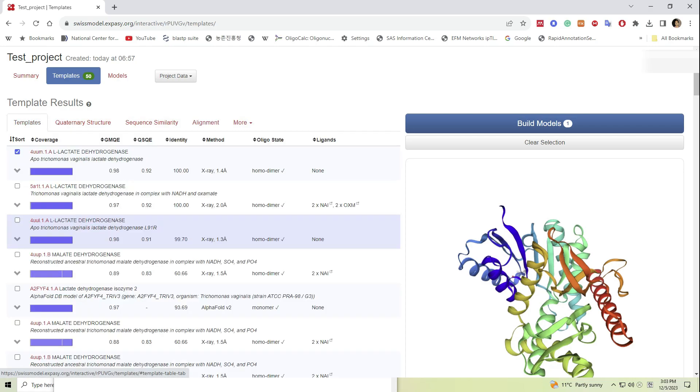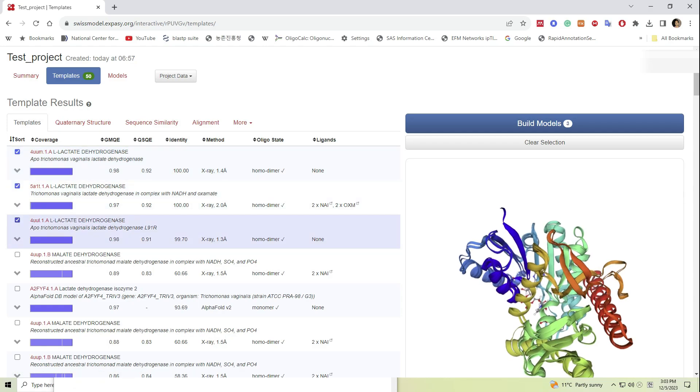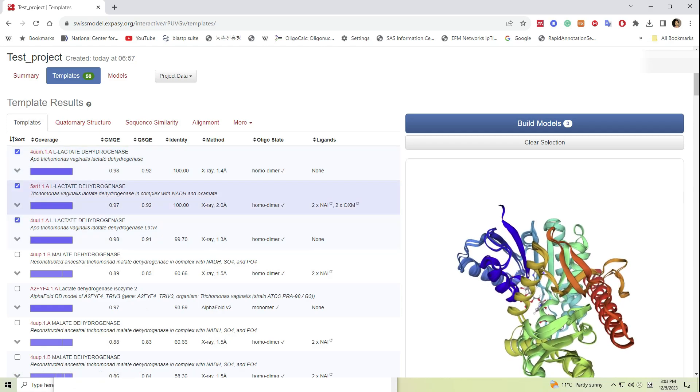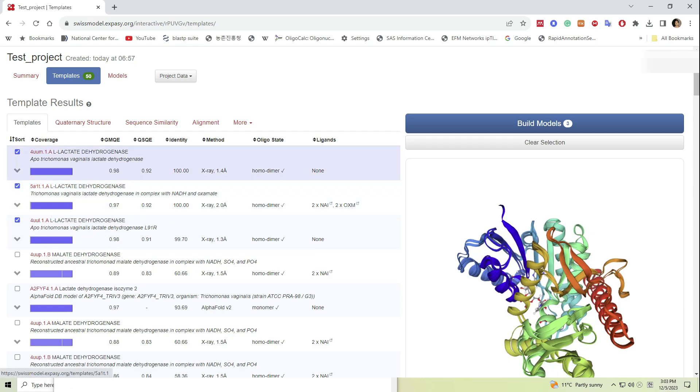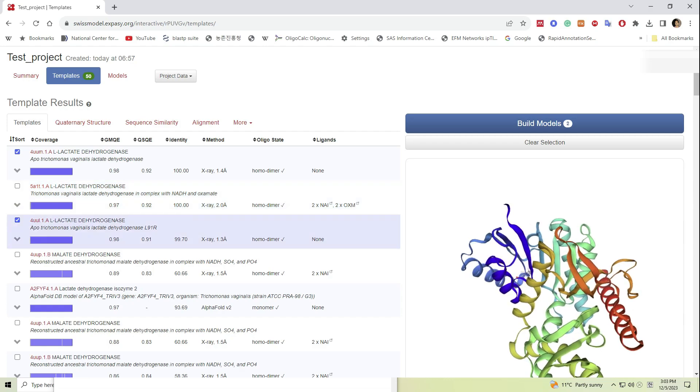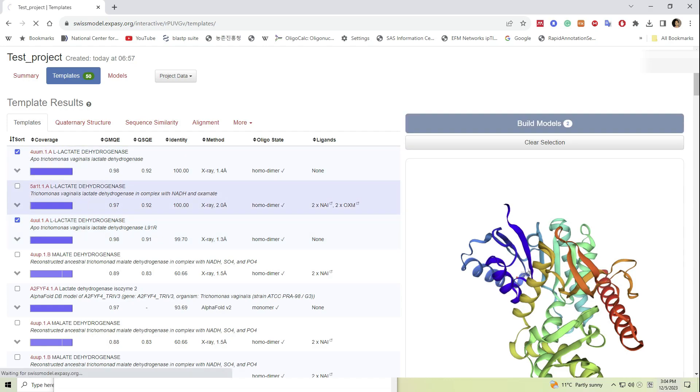Here let me choose first and third protein templates for the easiness of the presentation and let's proceed. Click on build models. Now we have to patiently wait until several models are generated by SWISS-MODEL.